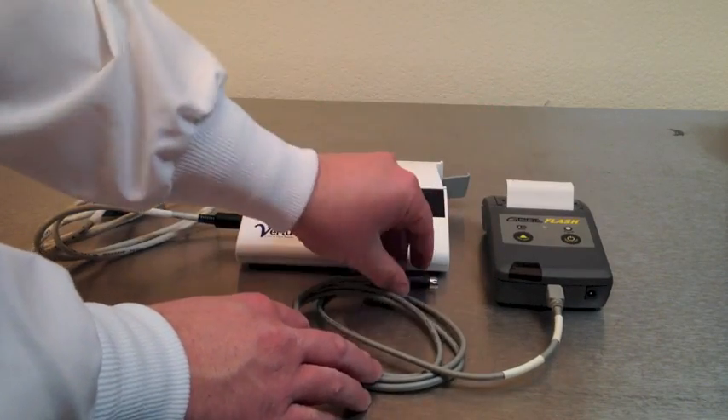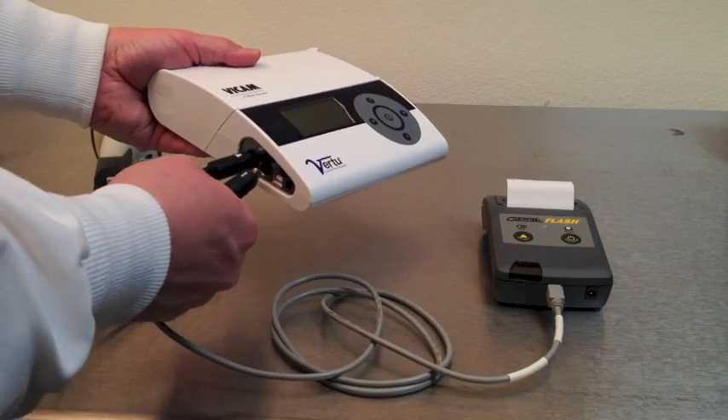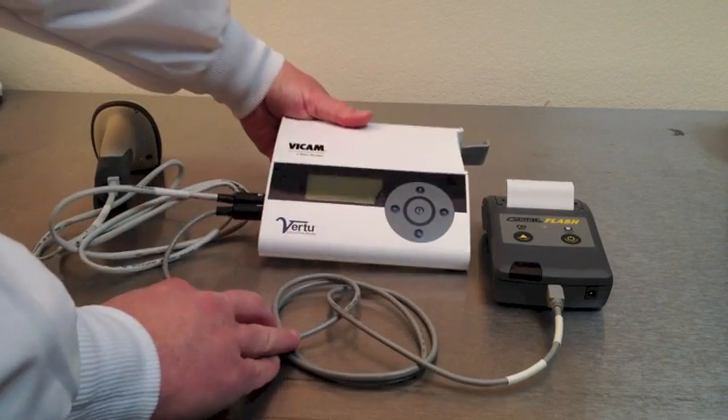Plug the USB port to the bottom of the printer and then plug it into the other port on the side of the Vertu. You'll also see a power supply on the side of the Vertu. You can plug this in to charge the rechargeable battery.